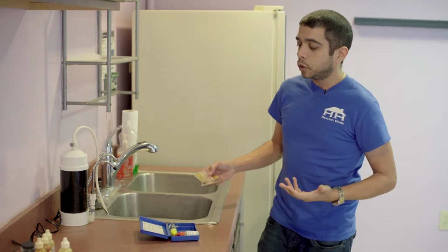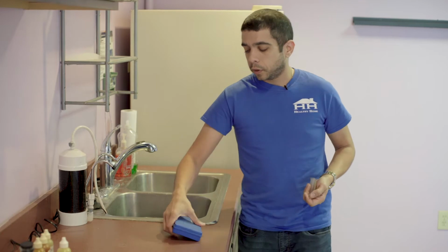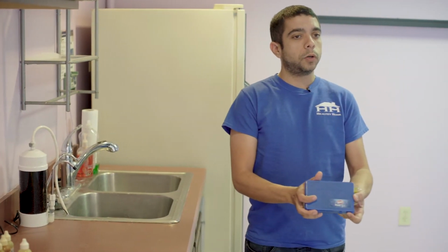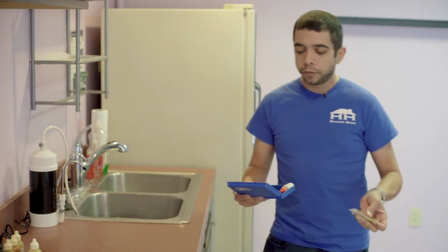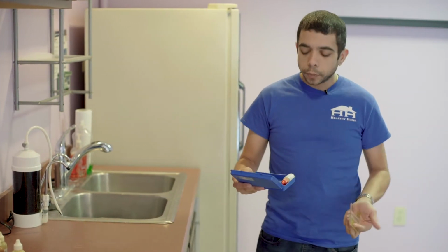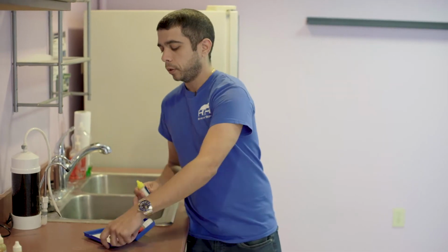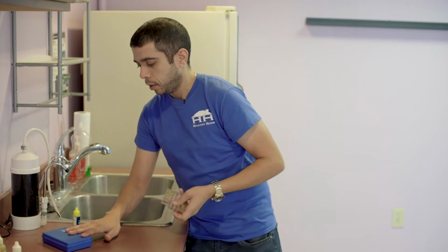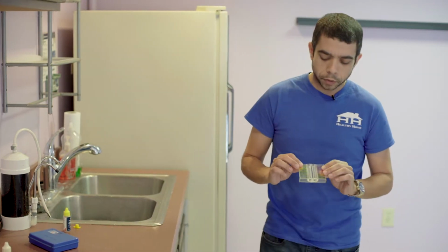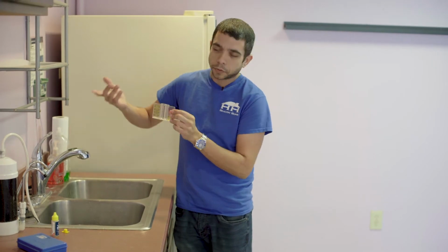Now, in order to show you what's going on, I'm going to use a very basic pool test kit. A lot of you have probably seen this before. Makers of Clorox provide these at your local Walmart, and they test for three things: pH levels, bromine levels, and chlorine levels. For this test, we're going to test our chlorine count, and over here we have our little chart and the CL. That stands for chlorination, naturally.